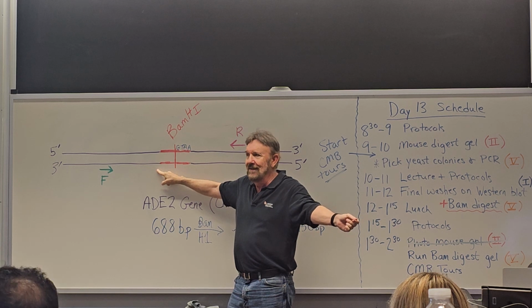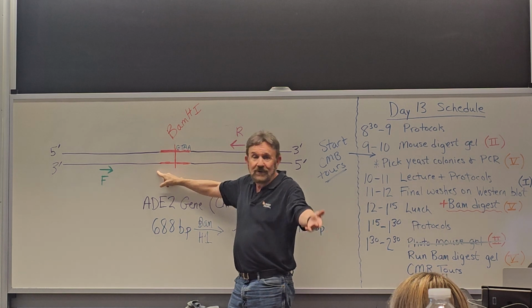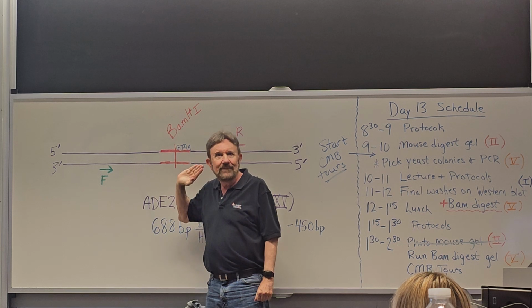I don't think it's because you all picked 2 colonies accidentally, which would be weird. It's a good idea, but I don't think that's it for that reason. That makes sense to everybody?